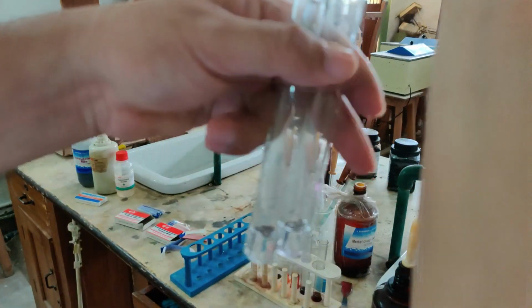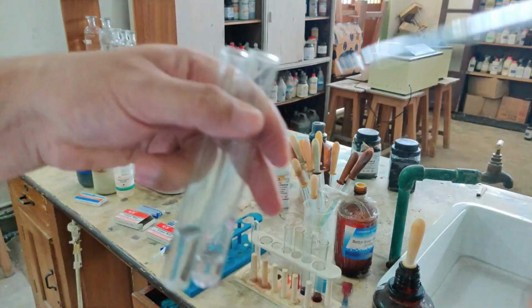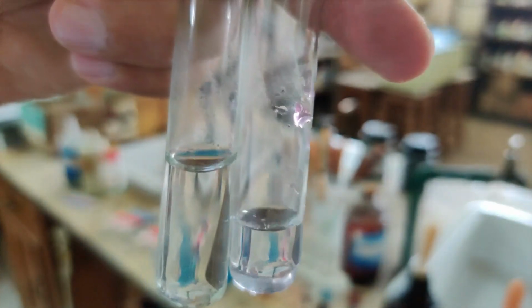You can see now whether any color change is taking place in the first one. You can notice that there has been no change in the color. Even though so much acid has been added in the first test tube, there has been no change in color. That's why phenolphthalein remains colorless in the acidic medium.